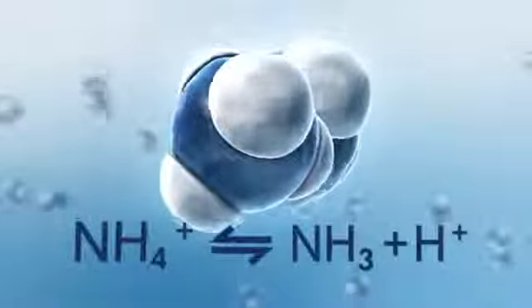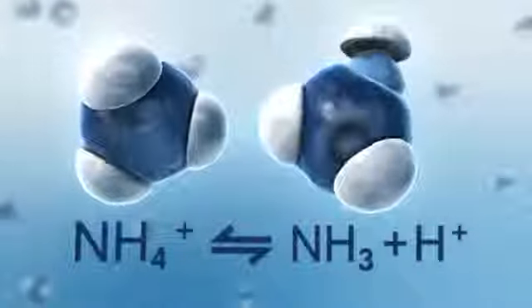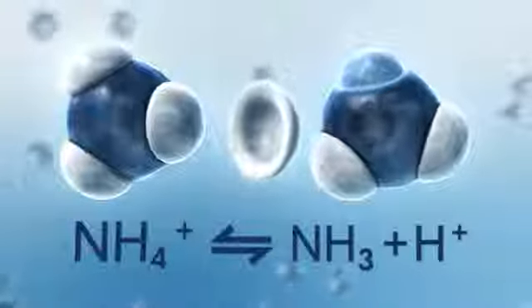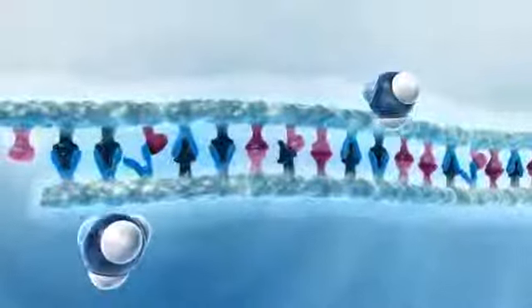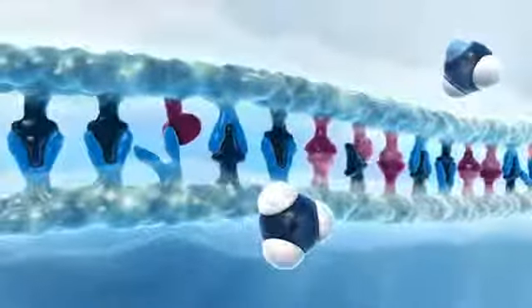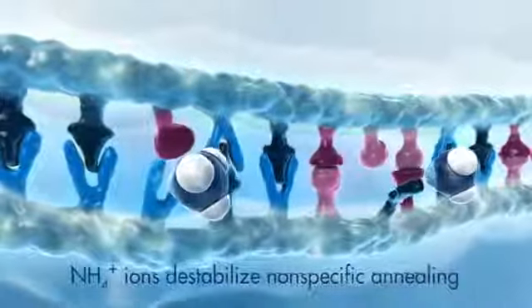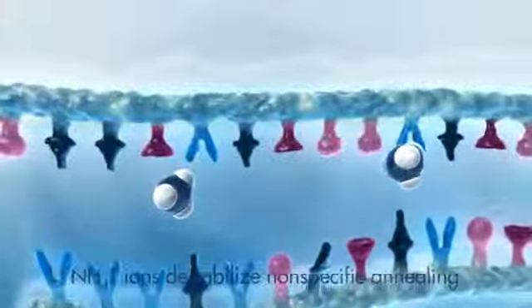ions. In an aqueous solution under thermal cycling conditions, NH4+ exists both as the ammonium ion and as ammonia, and interacts with the hydrogen bonds between the bases. The free electron pair of the ammonia molecule competes with the bases for the hydrogen in the hydrogen bonds and destabilizes base pair binding. Because hydrogen bonds are weak, base pair mismatches break and primers are then completely removed from the template strand.